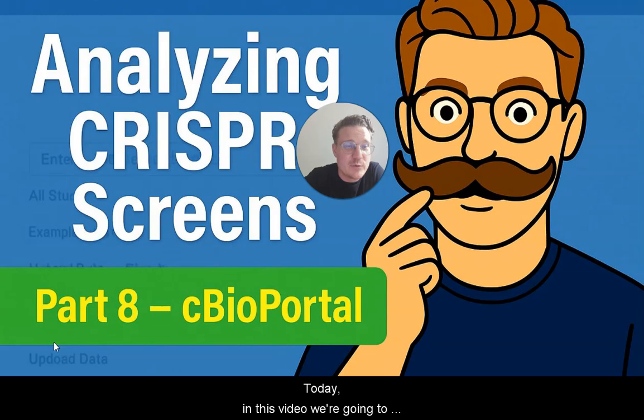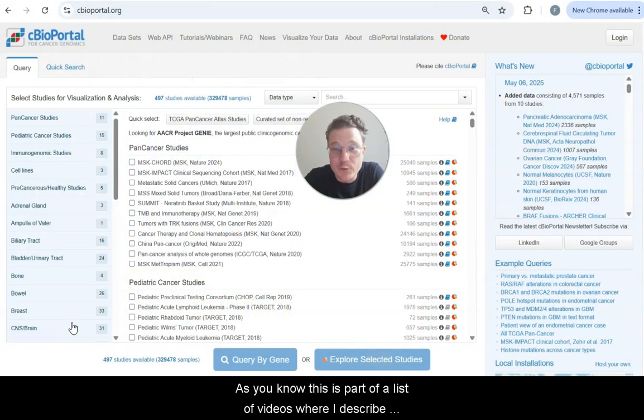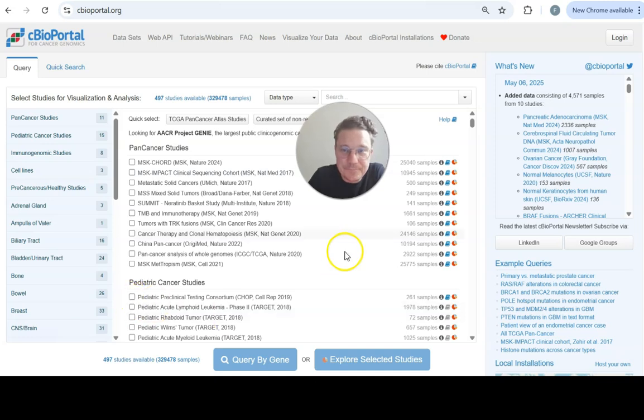Today, in this video, we're going to talk about analyzing CRISPR screens using cBioPortal. Once again, a super impressive database with so much data in there. And as you know, this is part of a list of videos where I describe different tools that could be used to analyze CRISPR screen data.